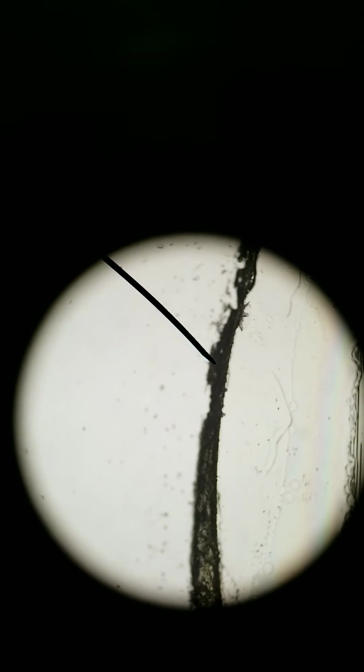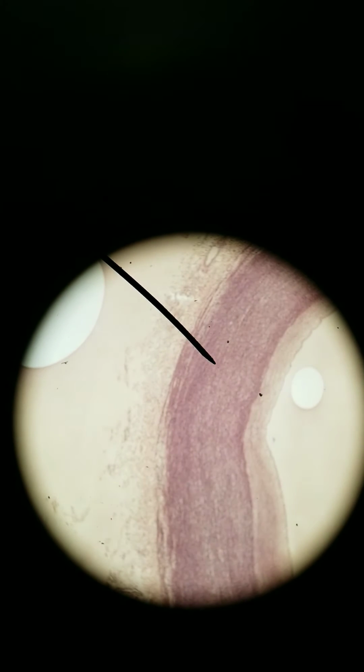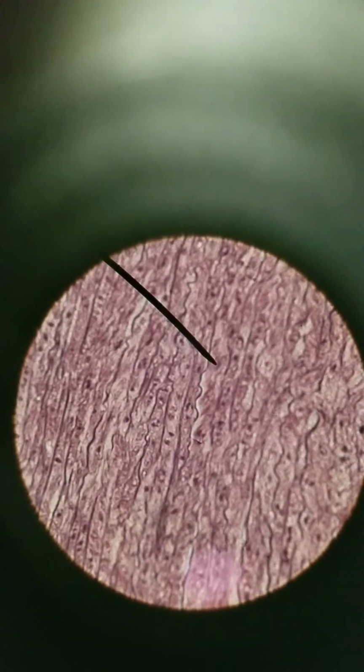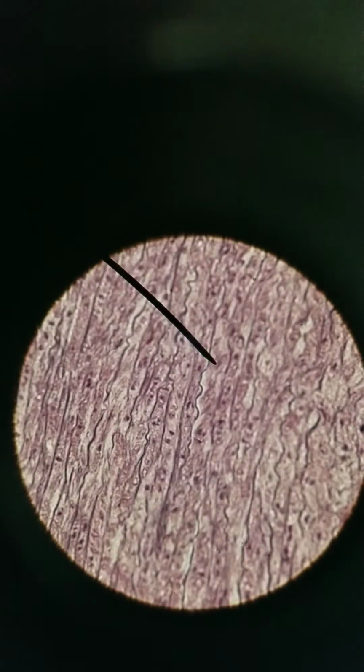Our last connective tissue proper is similar to dense regular in that the fibers all go the same direction, but it's not primarily collagen. We're at 100x right now. We are in the aorta. The aorta is the largest blood vessel of the body. I'm going to go to 400x. It's the largest blood vessel of the body, and so it has to withstand all the pressure of blood coming out of the heart. To withstand all that pressure, it needs to be stretchy and elastic.